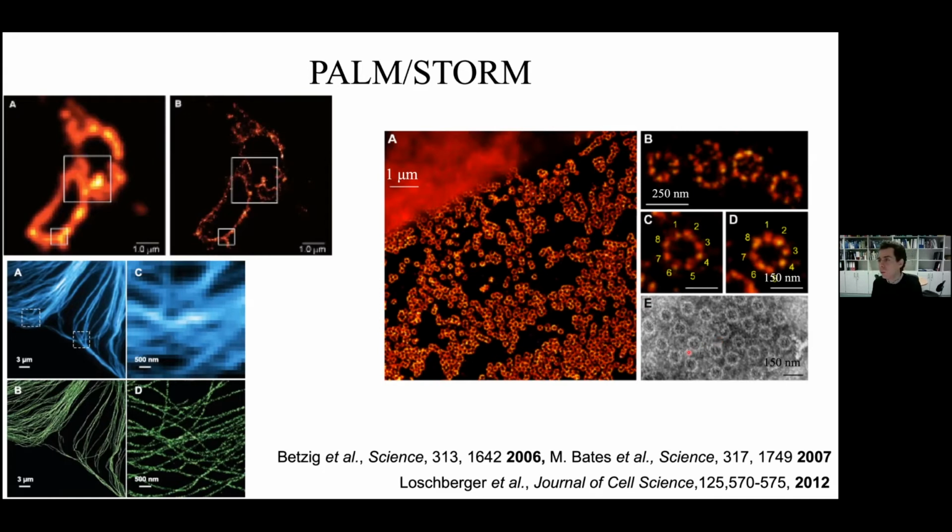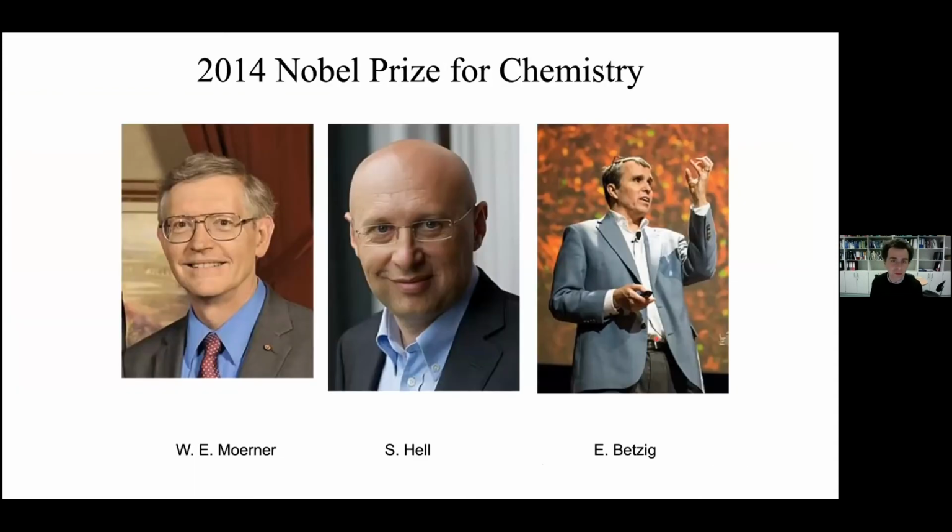Okay, what's the catch? The catch is that, of course, you have to do this sequential cycle of activation, localization, bleaching, and repeat and repeat. Sorry, I always skip the Nobel Prize winners, but this substantial achievement was recognized in 2014, relatively shortly after the field somehow exploded in 2006, by awarding the Nobel Prize for chemistry, again for chemistry, not for physics, pointing to the fact that the probes and the developments in the analysis, rather than the optics, were the key here to these people.